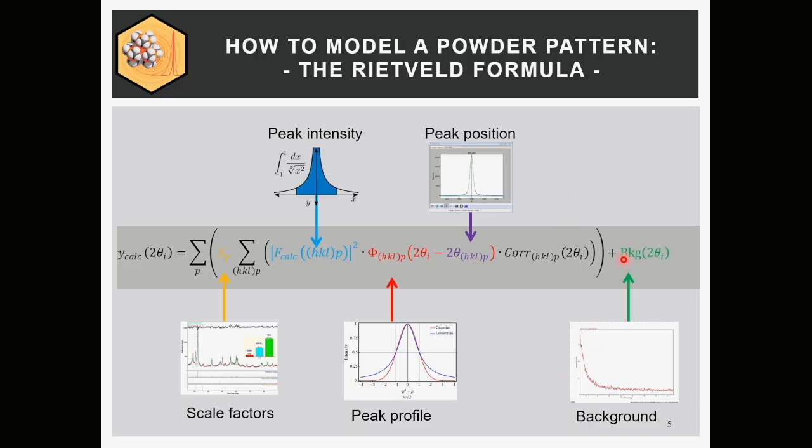Yeah, and then the double sum is closed, and then this is the background, and as I said, in Rietveld refinement, we don't really care about the background very much, so what we usually do is we use just a polynomial of some order. So we hope to find a polynomial where the coefficients are not so much correlated. Usually these are Chebyshev polynomials, still correlated, but they should behave in a smooth way. So you don't want any strange features in the background. Or you can put in broad peaks as a background. It's also perfectly legitimate.